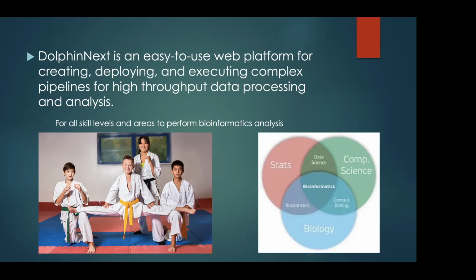Or you can just use our RNA-seq pipeline, just press the run button, fill the form, and submit the job to our cluster and get your reports. So it's up to you how you want to use it. But I know people, I started getting emails from people on LinkedIn that they found a bioinformatics job. Before, when they were at UMass, they were bench scientists, for example. After they took our boot camp, they became bioinformaticians. I'm seeing them and feeling extremely happy.